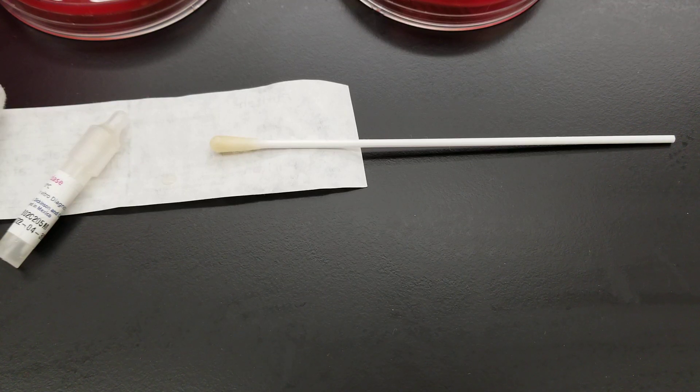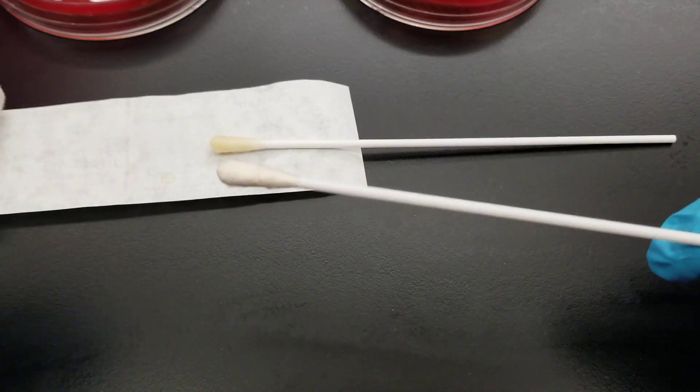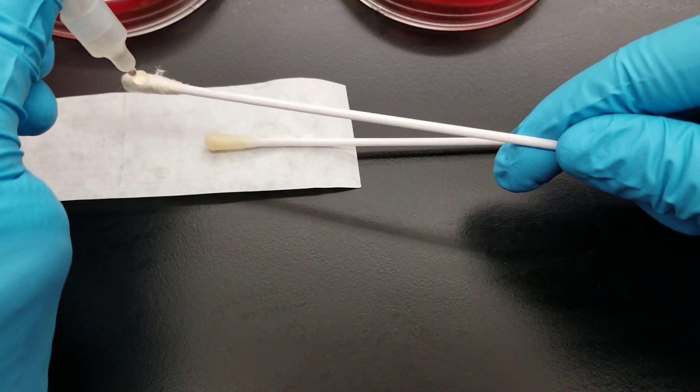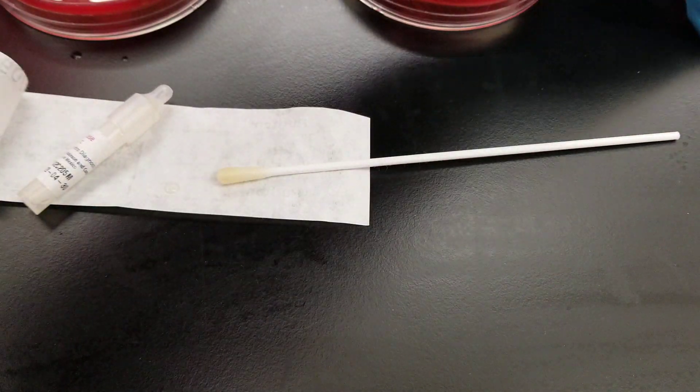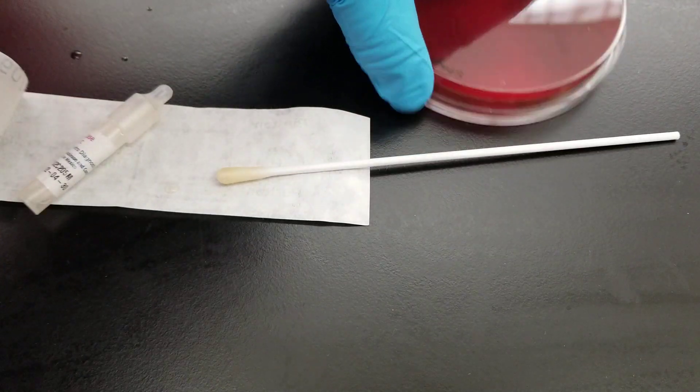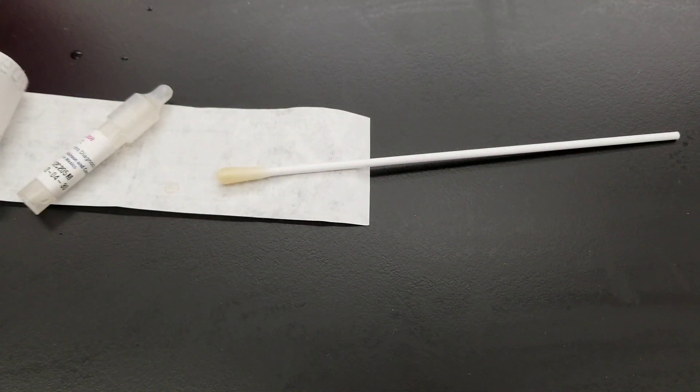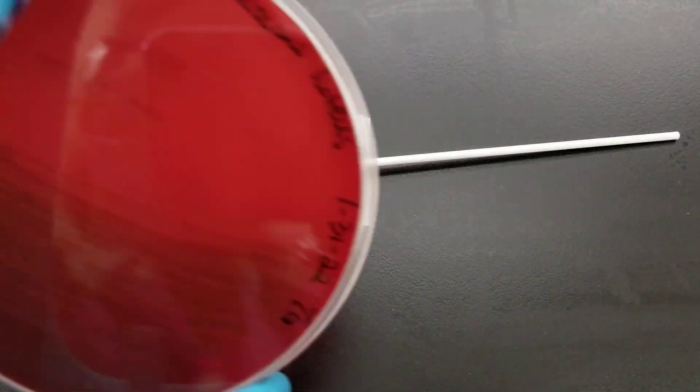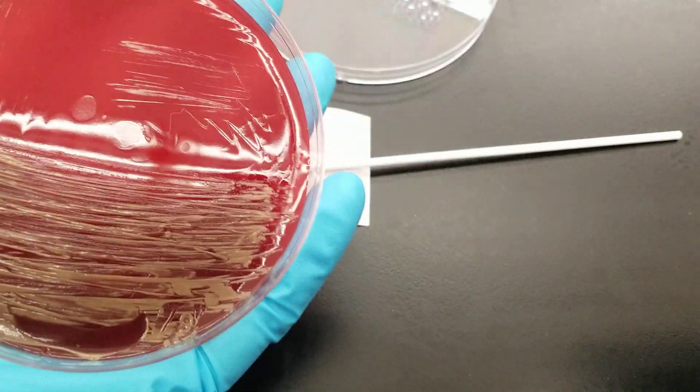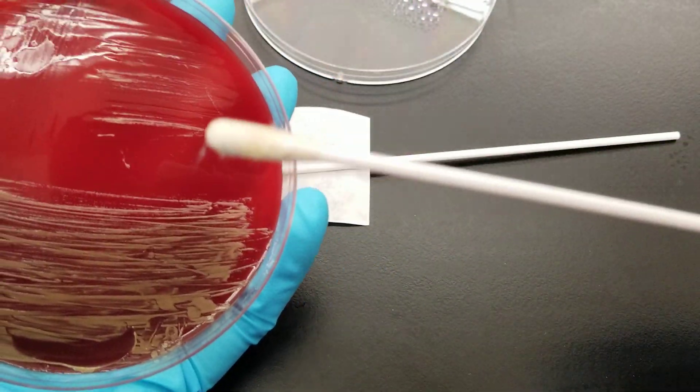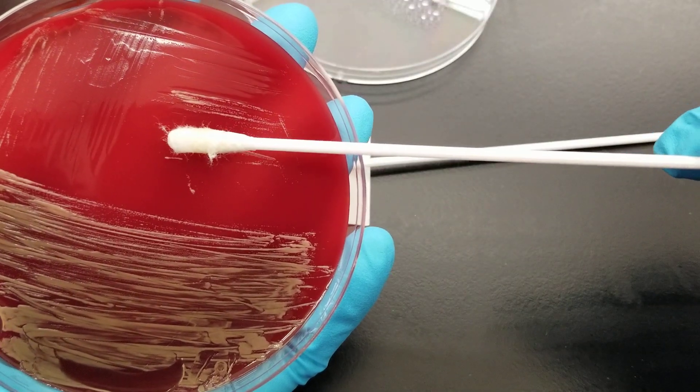Let's do micrococcus luteus so you can see that too. I'm pulling out another set of swabs. We're going to do this one. Saturate the swab. Get the correct bacteria. We already did staphylococcus, now micrococcus luteus. So that's the guy we're going to use. Still going to go out to the saturated part, out towards the end.